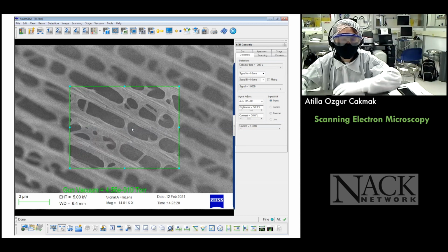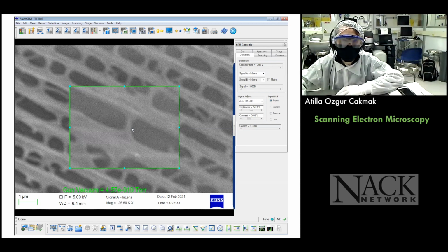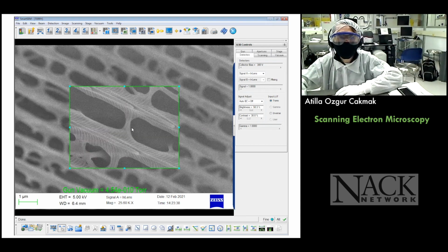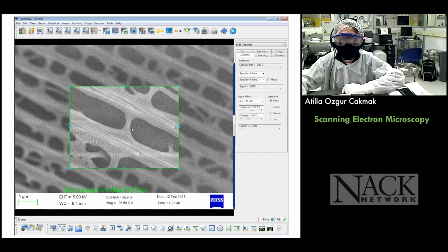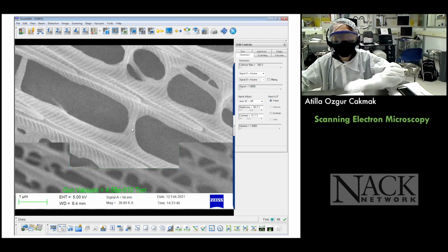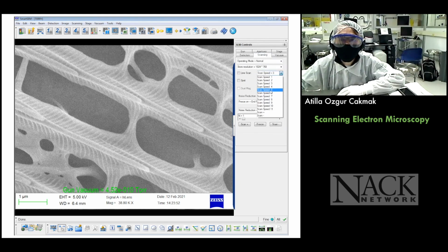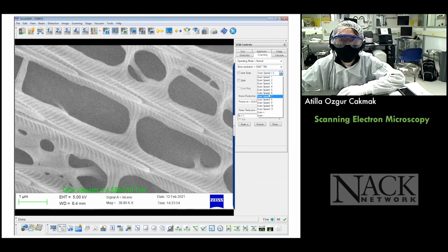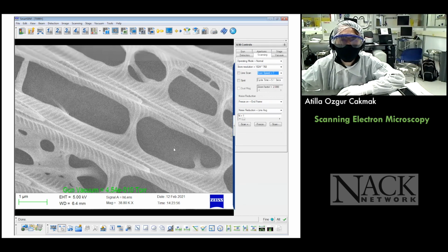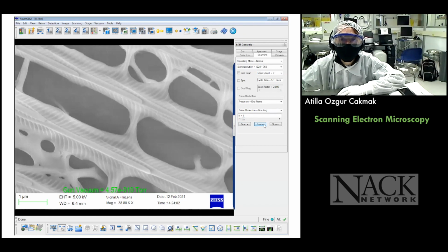So remember the electron magnetic lenses. I'm using them to focus onto the object like this. I can focus and then lose my focus, something like that. And then I can play with my contrast to better enhance the quality, and then zoom in more. Like, say, stop here. And then I can just get a better image by using these other functionalities of an SEM to do some more image processing to reduce the noise.